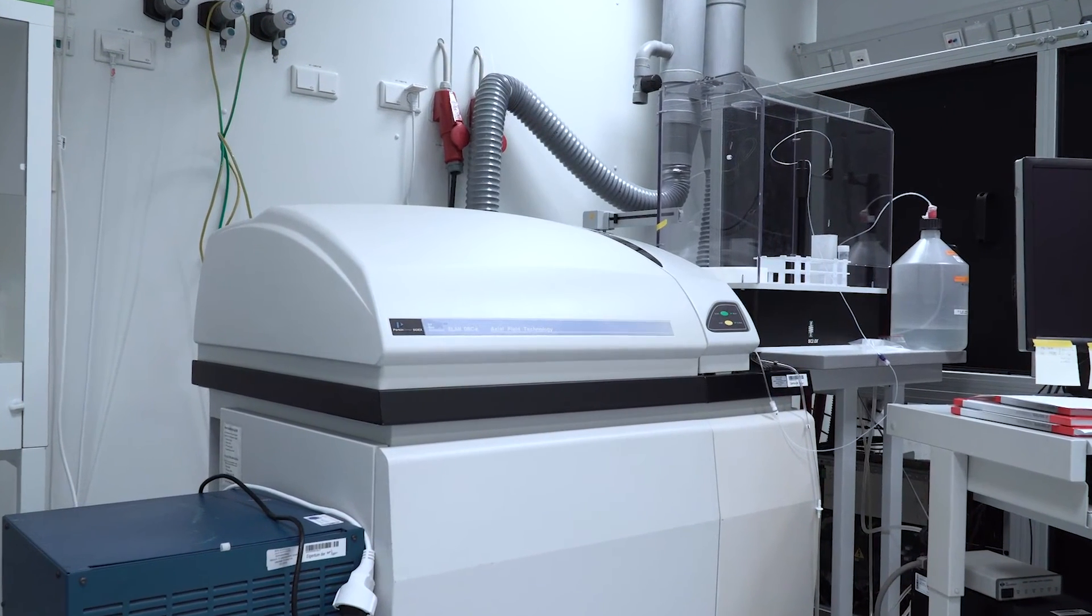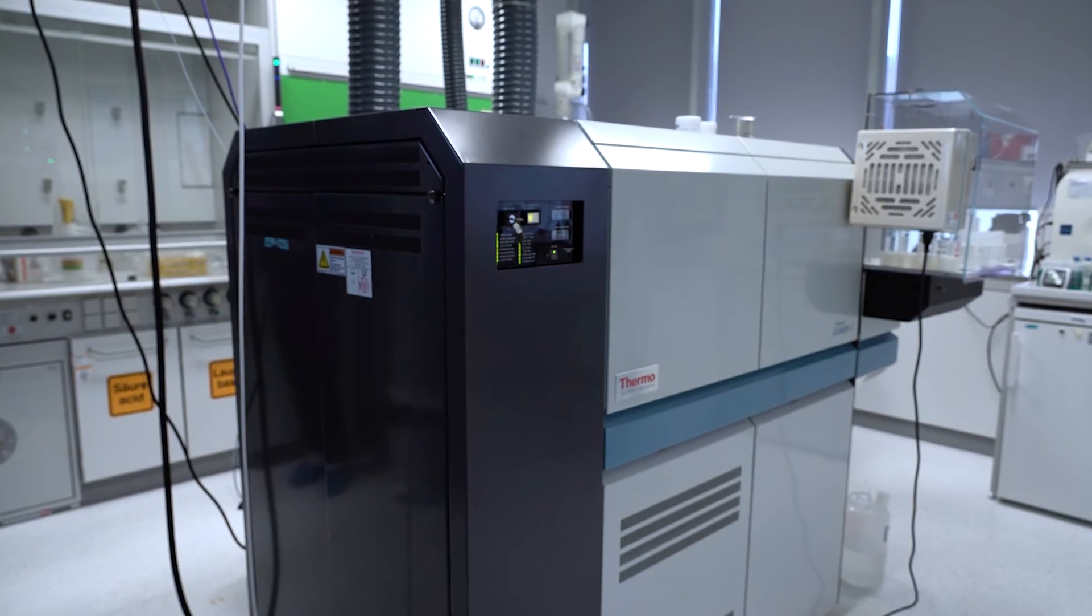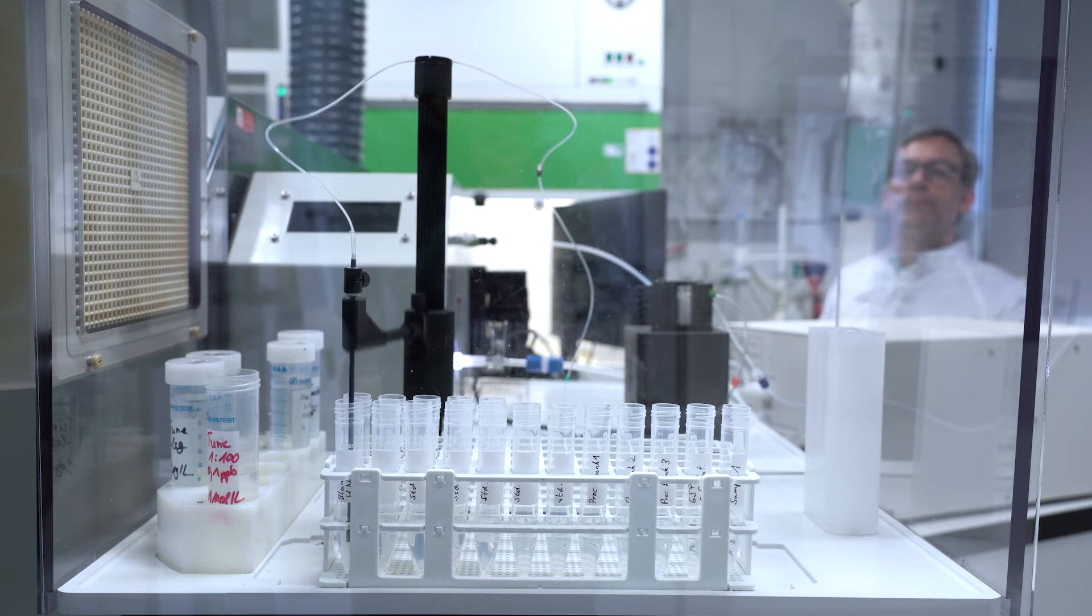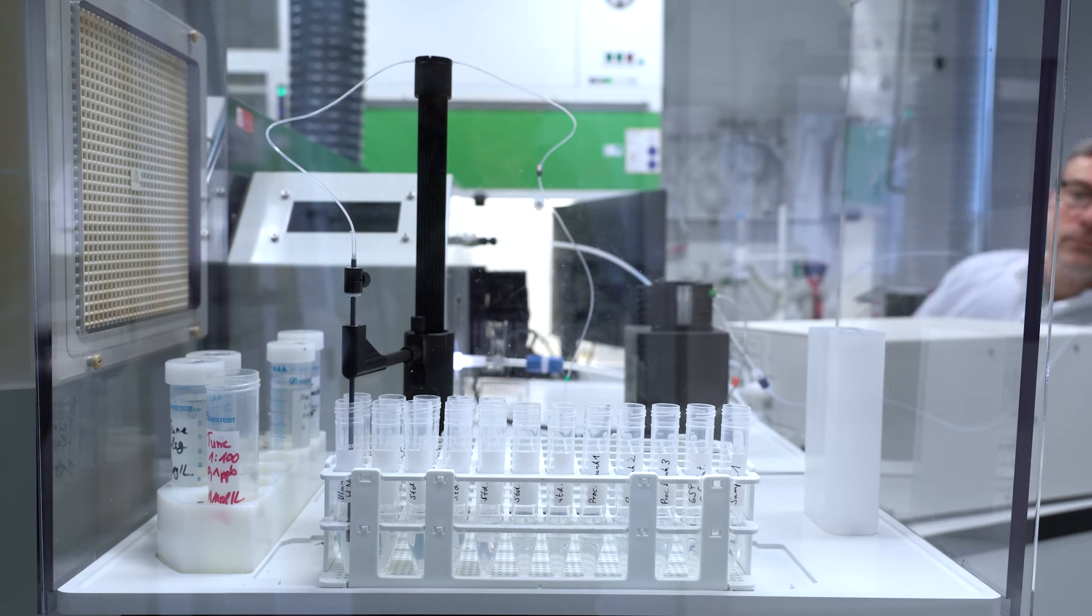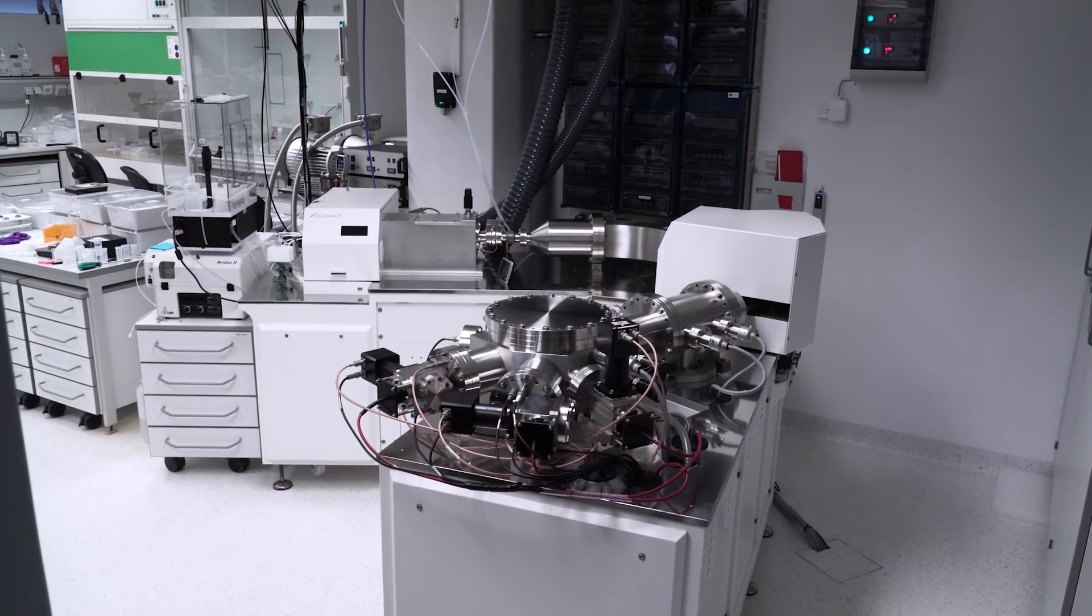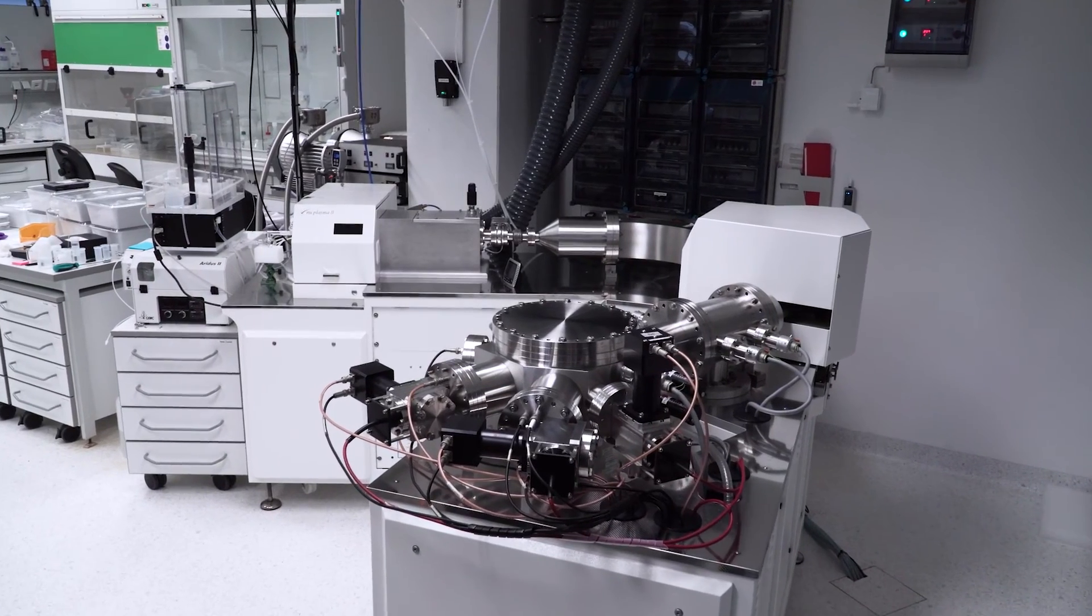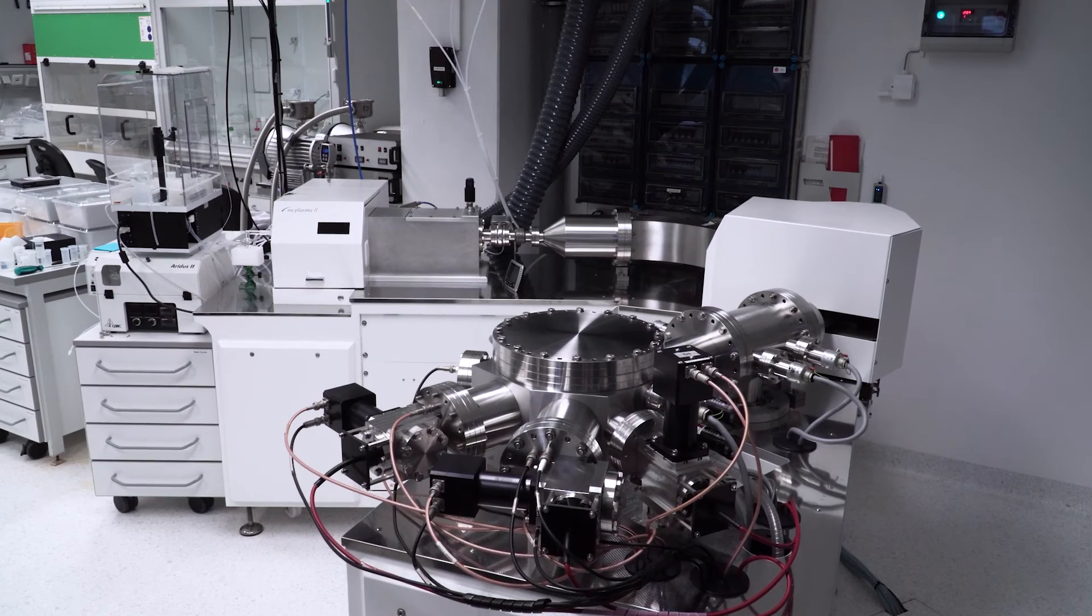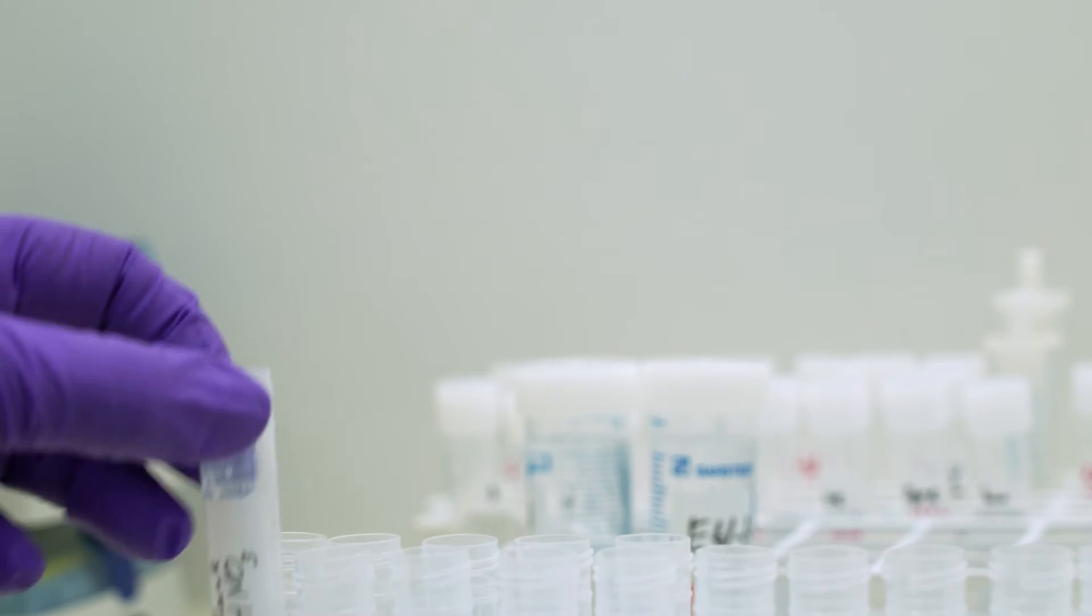Quadrupole ICP-MS and high resolution ICP-MS are used to measure basically all trace elements and some isotope ratios. The most precise measurement of isotope ratios can be done with a multi-collector ICP-MS like this instrument.